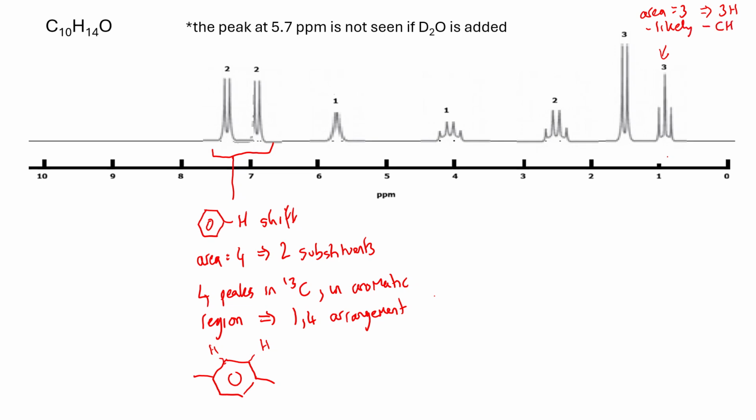In fact, it has to be a methyl group because we've used up all our symmetry in the benzene ring, but anyway, likely to be a methyl group. And it has an HCR shift, which means that it's not directly bonded to the benzene ring, but in any case that would have to be the case because it wouldn't be a triplet if it was. So HCR shift doesn't really tell us anything important, but we must still note it down. But what is important is that it's a triplet.